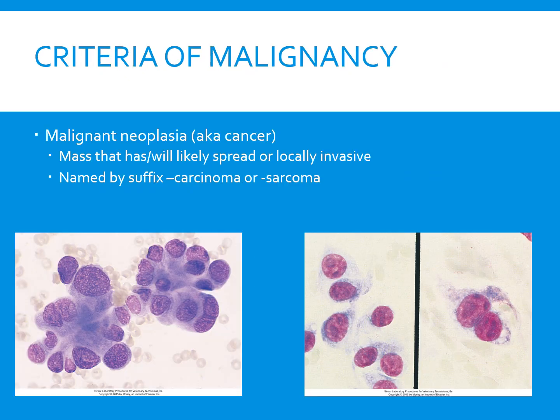With a suspected cancer, the cytology is going to look a little bit different. And most often, these cytologies are going to be read by either experienced veterinarians or pathologists. But we can see things such as lymphoma, carcinoma, or sarcomas. And if we see signs of cancer, usually this is the type of mass that will likely spread or is locally invasive. So if something is malignant neoplasia, it is cancer. And usually these cells will have at least 3 of what we call abnormal configurations.